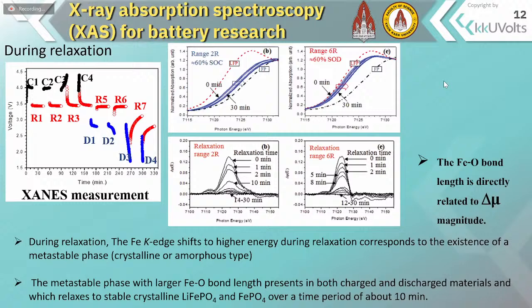As revealed in the figure, during relaxation, a shift of iron K-edge to higher energy corresponds to the metastable phase, or dynamic phase.